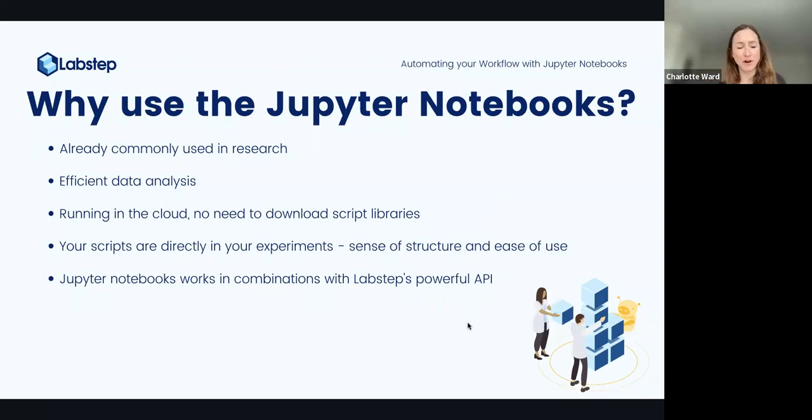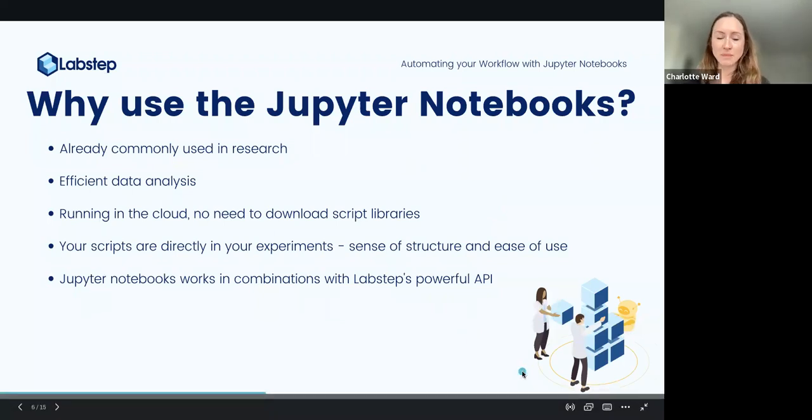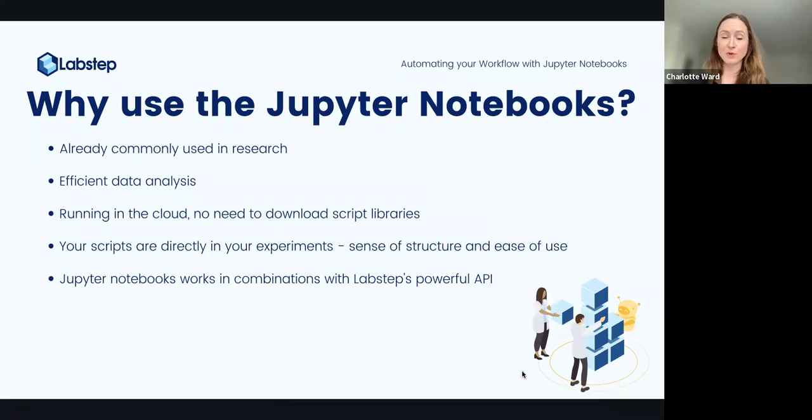Yeah, sure. So this might be functionality that our current users are already using. As you say, we've got an API which allows you to do slightly more powerful or sophisticated things than you could do through the user interface. Things like editing your resources or accessing your data. And this is all Python-based, the SDK, which we use to access the API.